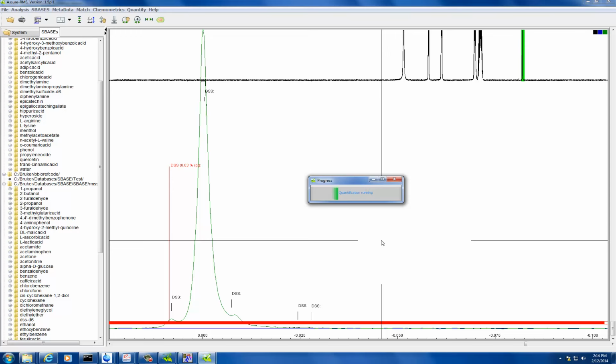So you can see when you have your own compound or your own botanical material, you're going to really start pulling in different compounds, start defining areas. You're going to test it. It didn't work. See, you go back and forth and try to make it perfect. And again, the good side about Assure, most of the time when I use Assure, it's actually offline. So I'll have my instrument running certain things, and then I'm maybe making a method or modifying a method. Then I get all the data into my laptop. Then I use Assure, and I just basically do offline analysis.